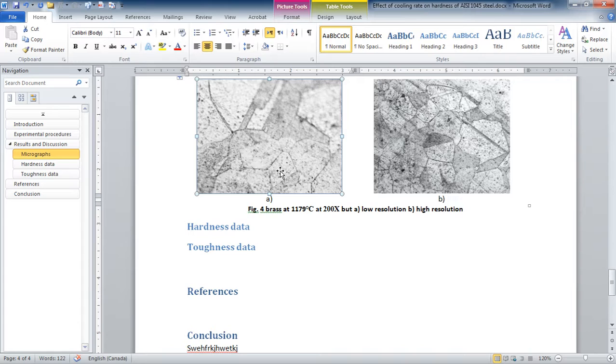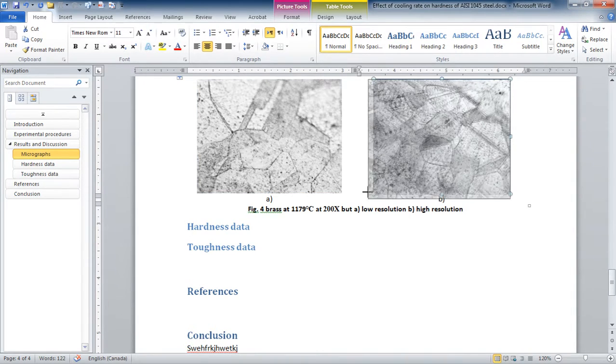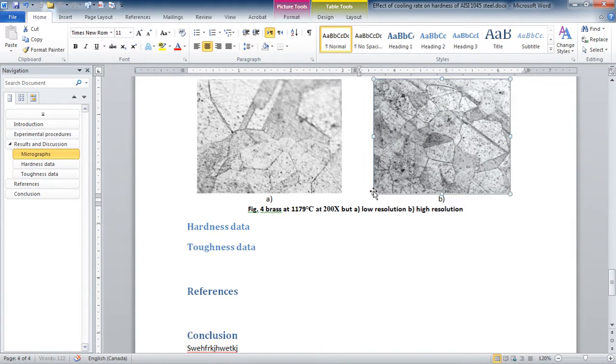Now when you resize that, the one that is bigger, this 2000 pixel image, shrinks down a lot to fit in this smaller space that I've given it, so that they look to have the same size. Okay, so this digital resizing that I've done creates a problem.